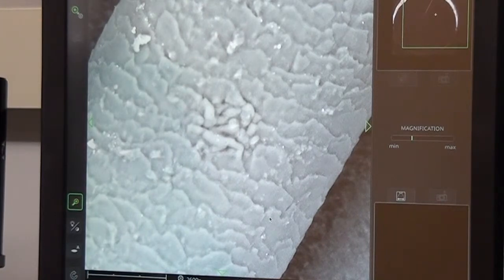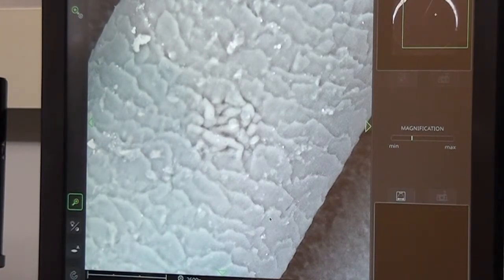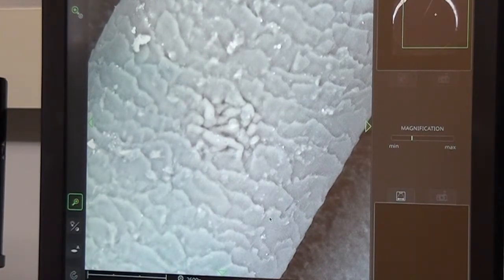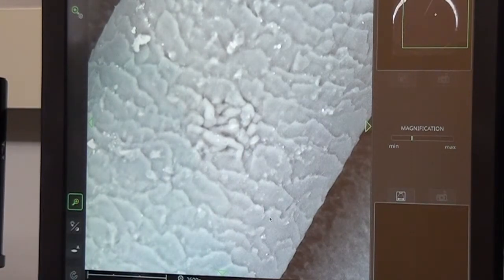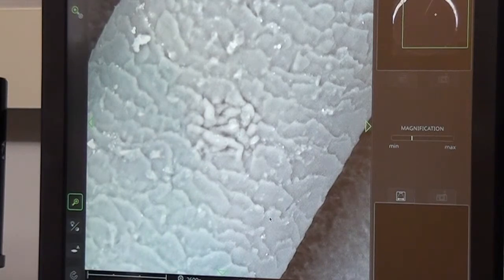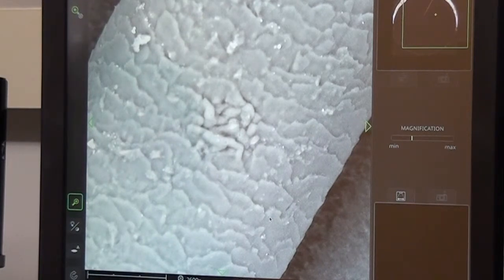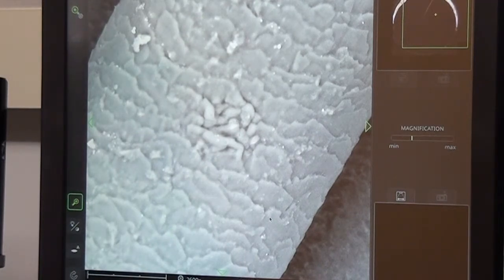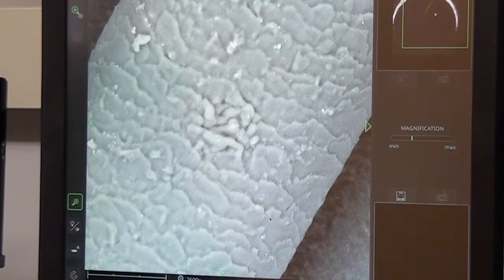When you're looking at a sample in an SEM, you have to strike a balance between how high a magnification you want so you can resolve the details you want to see and what that sample can handle. And it varies from sample to sample.